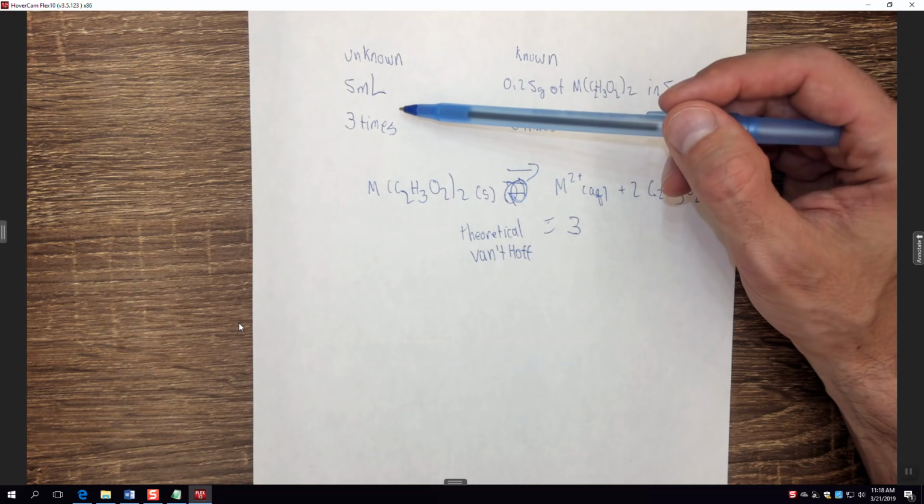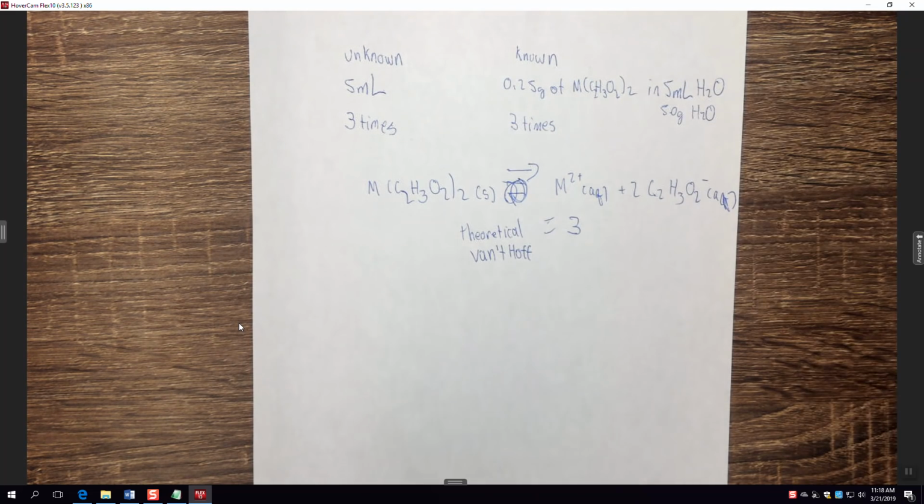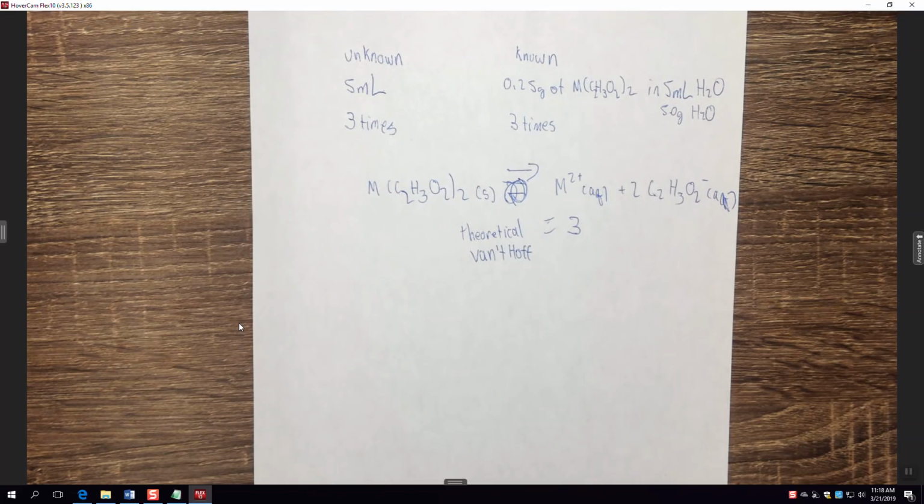molality, you're going to use the molality from the spectroscopy and the conductivity results, and hopefully those all match. If they don't all match, you're going to want to think about which of the 2 to use based on some possible contaminations that might be commonly found in solutions. Would commonly found contaminations be more likely to affect conductivity, or would they be more likely to affect absorbance? That's something you're going to want to think about when you use that experimental molality.